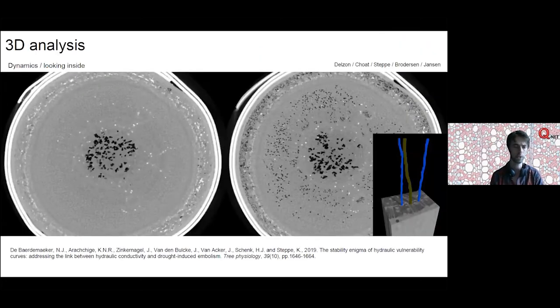Just to give you a few ideas, Tom mentioned that for him, for instance for the bristlecone topic, it's very important that you can acquire a 3D data set, but it's not always necessary to do 3D analysis with a 3D data set. It might be as interesting to be able to select the proper slice, starting from the 3D data set, but moving to a 2D image analysis tool chain.